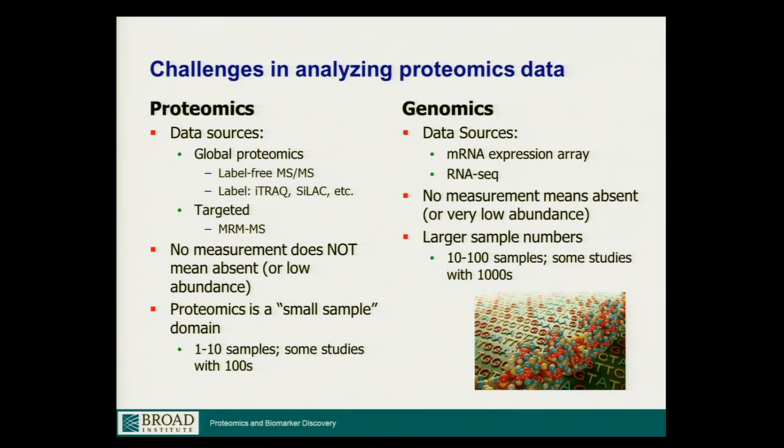One of the things you can do is, a lot of tools have been created for analyzing genomics data. For example, mRNA expression analysis has been reasonably well established for the last 15 years. So why can't you just take those tools and apply them to proteomics? To some degree you can, but you have to be aware of the challenges in looking at proteomics data.